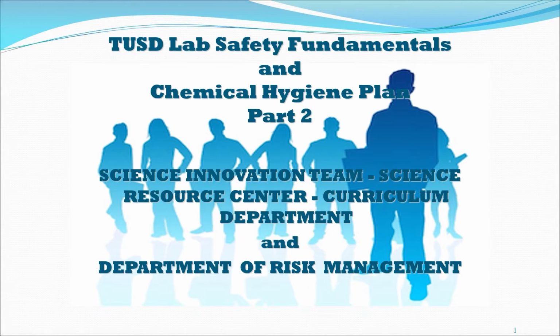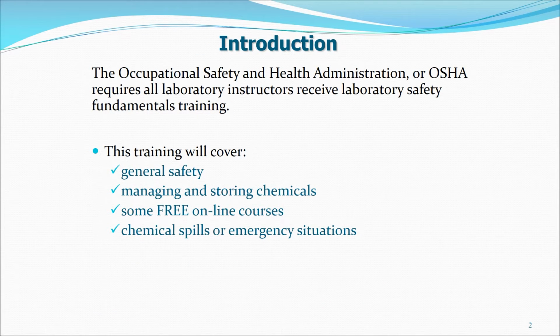The following slides will give you a brief overview of laboratory safety fundamentals for safety, chemicals, and lab equipment, and to help you protect your students and yourself while working in the laboratory. The Occupational Safety and Health Administration, or OSHA, requires all laboratory instructors to receive a laboratory safety fundamentals training. At the end of this brief session, you should be familiar with general safety procedures, managing and storing chemicals in the laboratory, available online courses, chemical spill or emergency procedures.